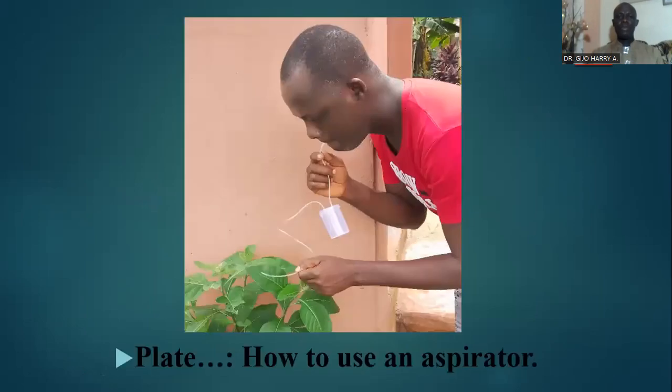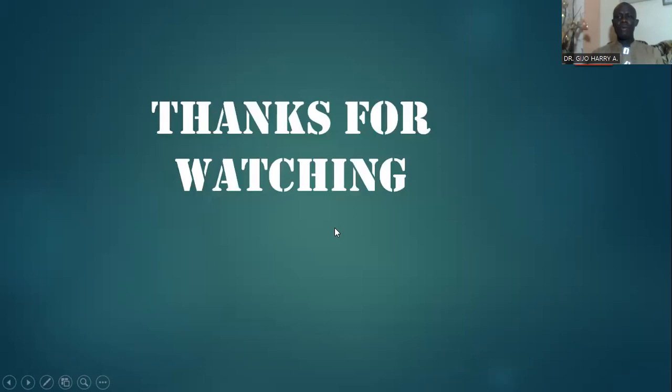The mouthpiece is sucked by the collector, and then the other end of the aspirator, the other tube, is held close to the insect. And then when the mouthpiece is sucked, the insect goes in through this pipe into the vial, and it is preserved for further studies.